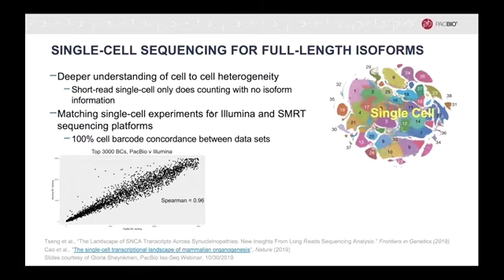So we wanted to also look at an additional layer of complexity for Alzheimer's disease. So we used long-read sequencing to generate full-length transcripts, but looking also at single cell level data.